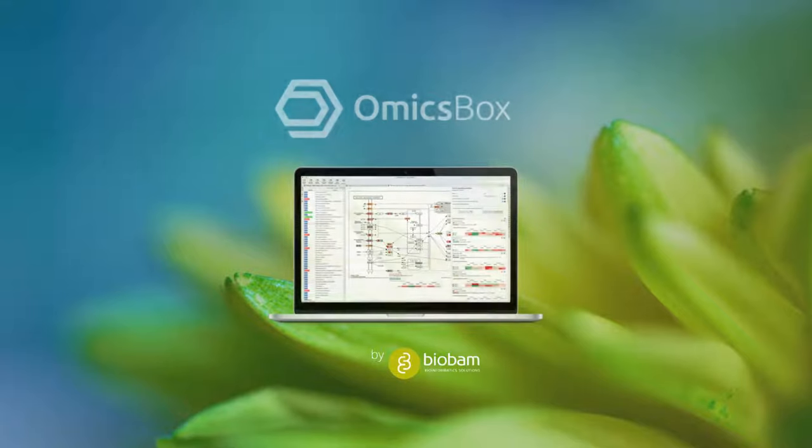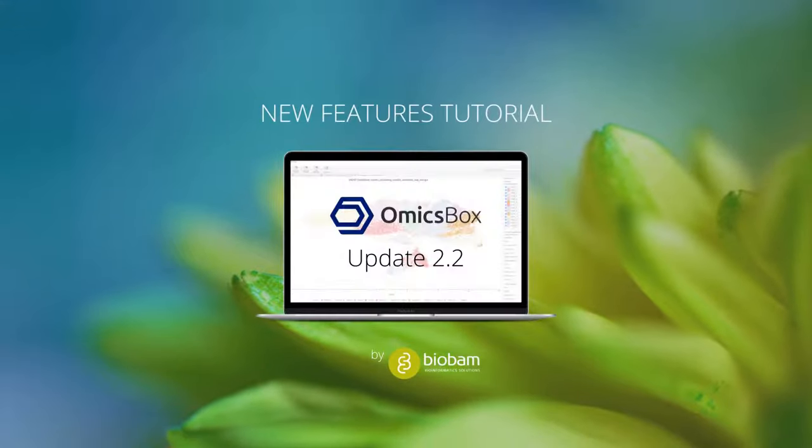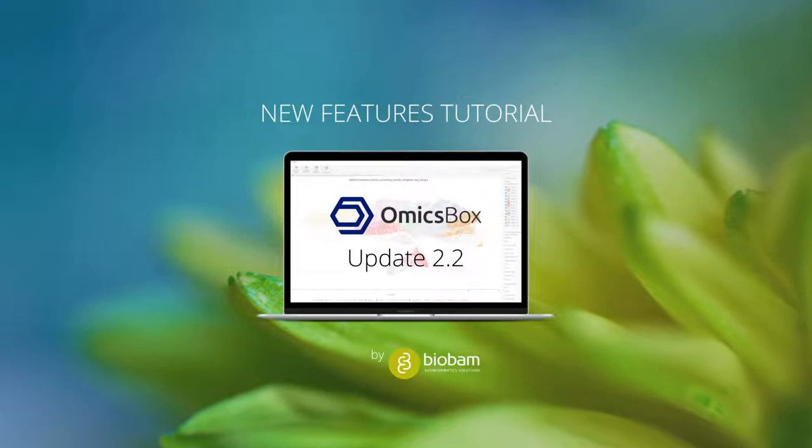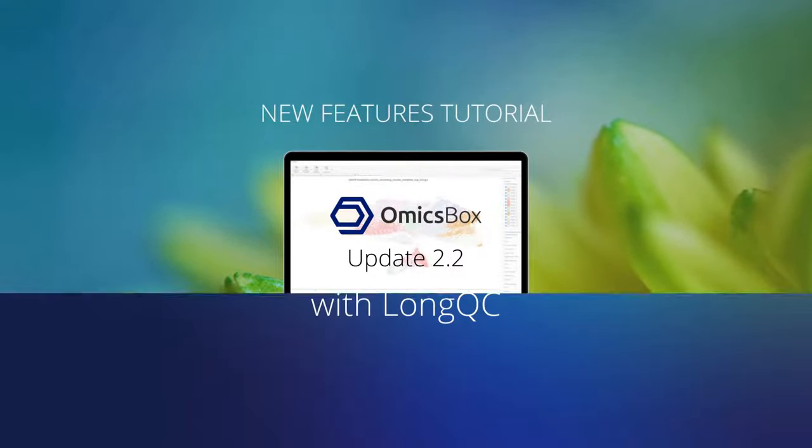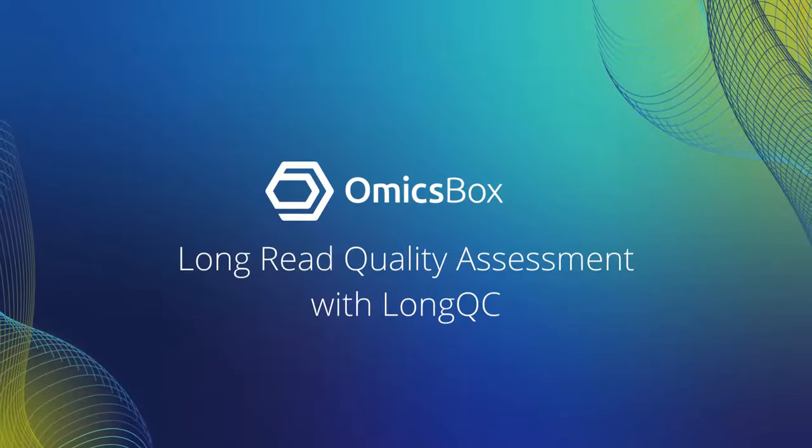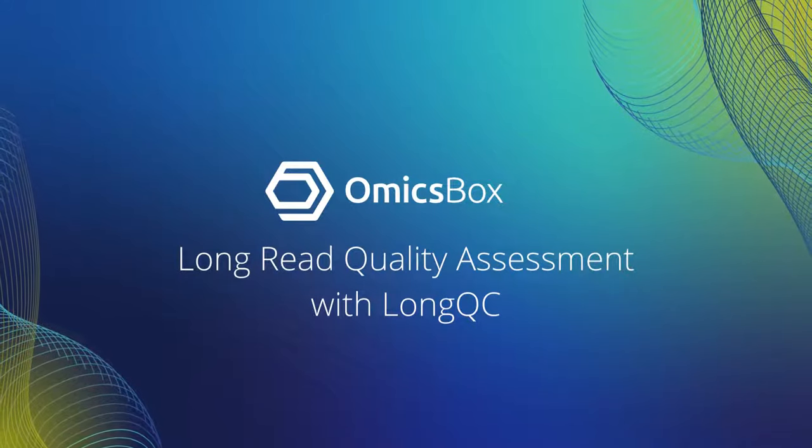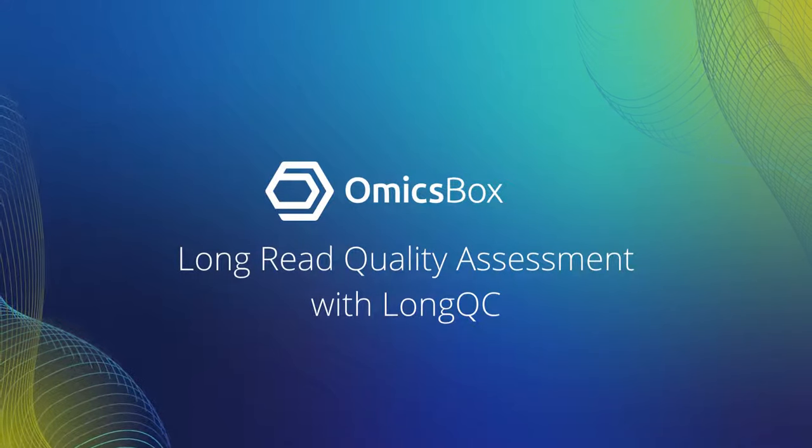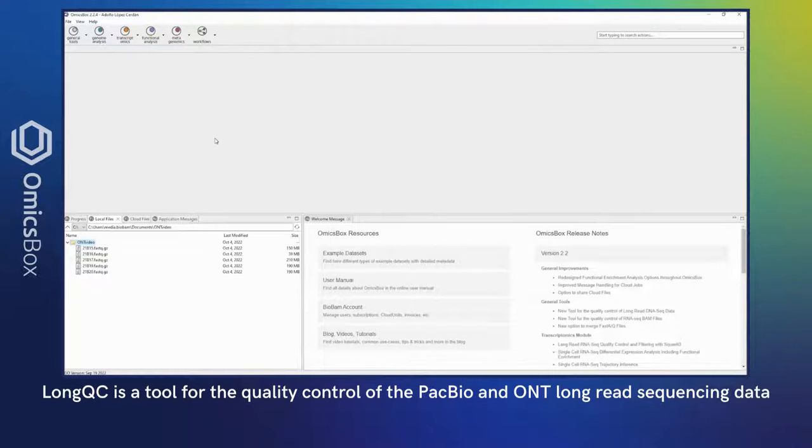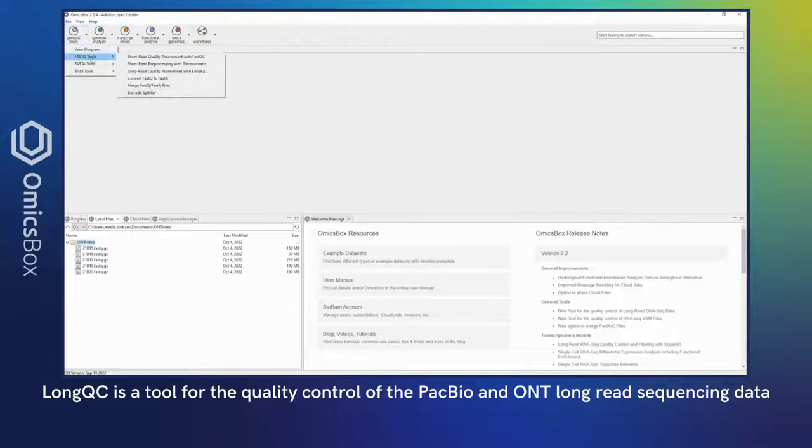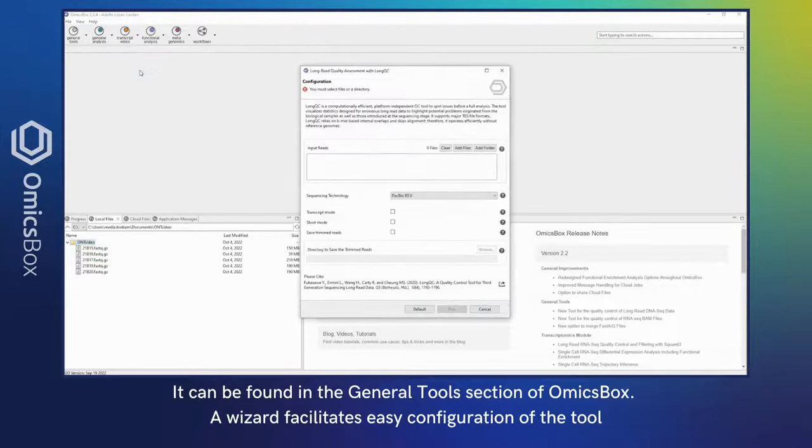Long Read Quality Assessment with LongQC. LongQC is a tool for quality control of PacBio and ONT long read sequencing data. It can be found in the General Tools section of Ohmixbox. A wizard facilitates easy configuration of the tool.